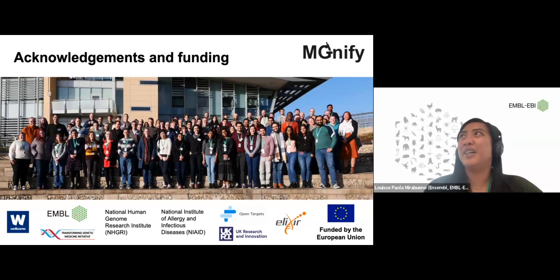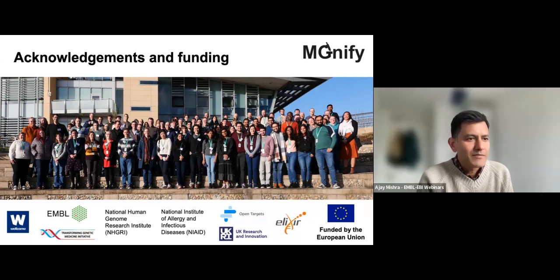So we have a bit of time for some questions, any outstanding questions. I'm going to go through them in the Q&A box. Yeah, we still have one question. I think Nishadi is already typing in the answer. There are several transcripts that you find for a gene on Ensembl, so how can one select the best transcript?